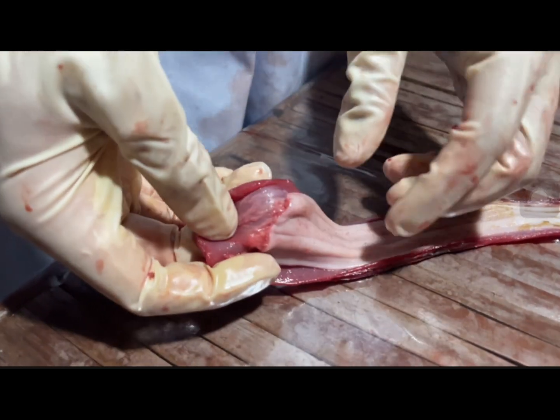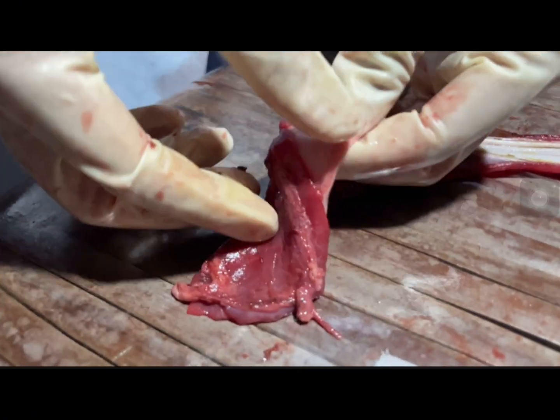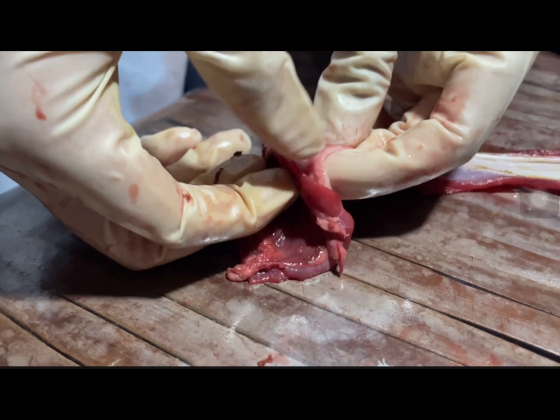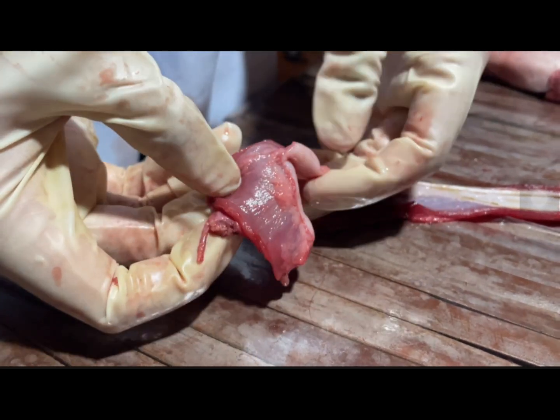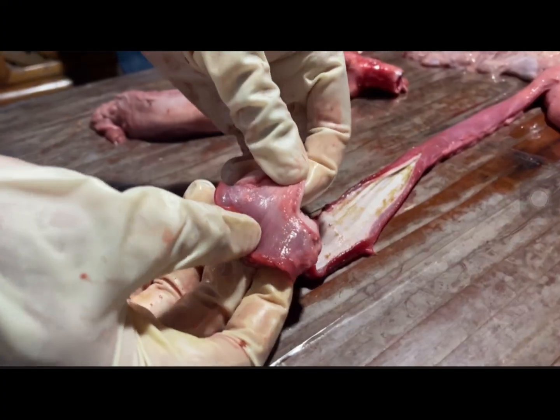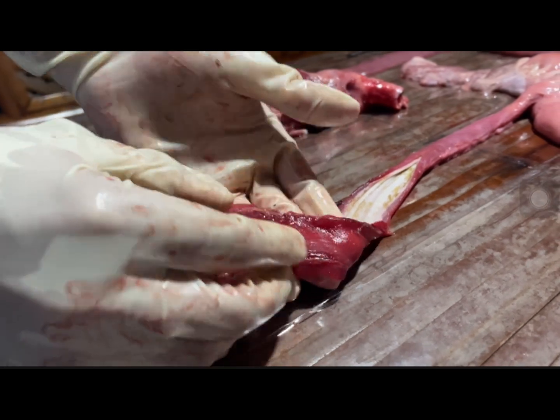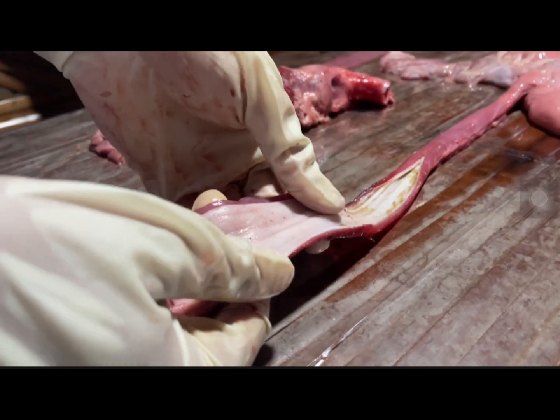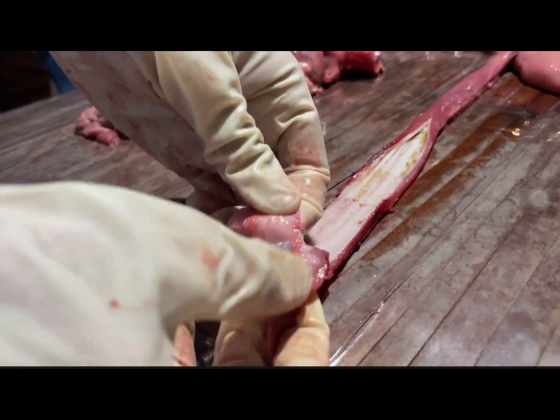This layer contains blood vessels, nerves, and mucus-secreting glands that aid in lubrication. Third is the muscularis externa. Notice the circular and longitudinal muscle layers. These are responsible for peristalsis, the wave-like contractions that propel food to the stomach. Lastly, the adventitia. The outermost layer secures the esophagus in place and protects it from surrounding structures.